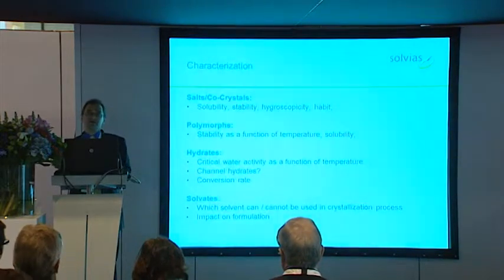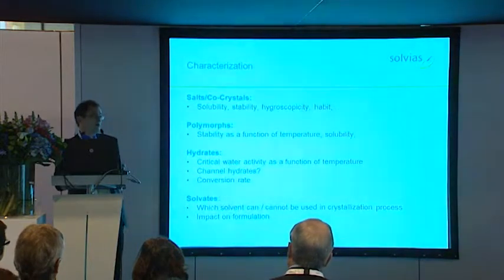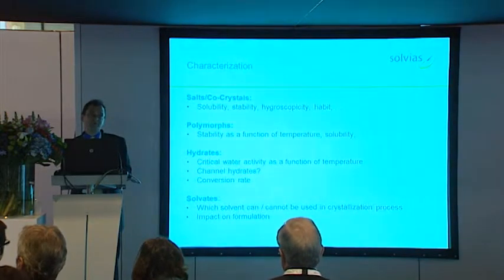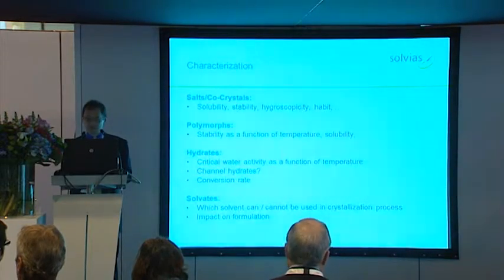And finally, solvates, while they are not important for the drug product, there are a couple of drug products on the market which are solvates, but only about 2. But of course, it's important to know if solvate formation happens, because these are the solvents you want to avoid for the crystallization process.